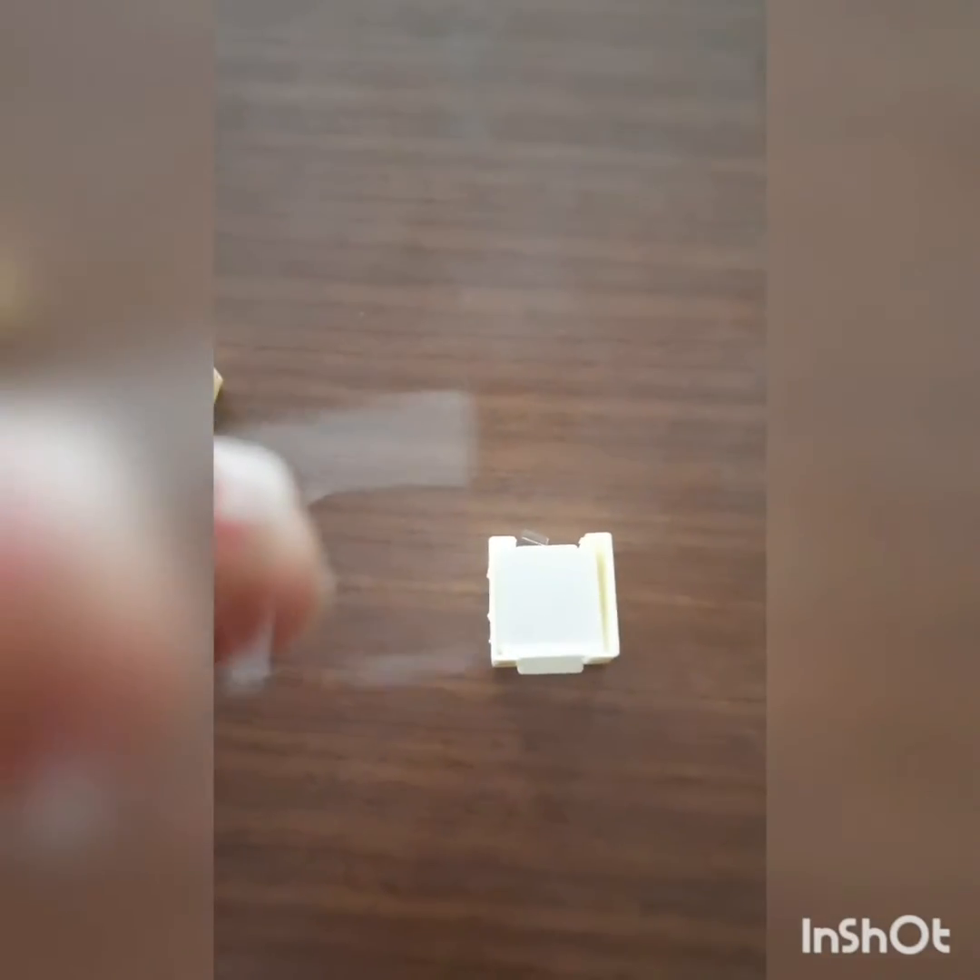Procedure: Firstly, take the sample of Ectocarpus plurilocular sporangia with the help of a forcep. Now stain the material in saffranin stain. Transfer the sample onto a clean glass slide with the help of a needle or forcep, after separating the filaments.